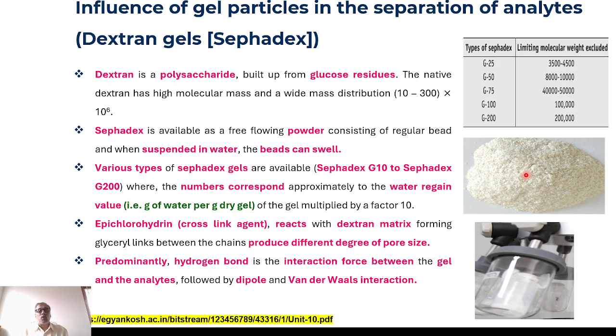So if you want to perform this experiment immediately, you cannot. You have to soak the Sephadex powder in the appropriate buffer with appropriate pH overnight. At least 12 to 16 hours of soaking time is needed so that the beads will swell and you will get a gel-like architecture.